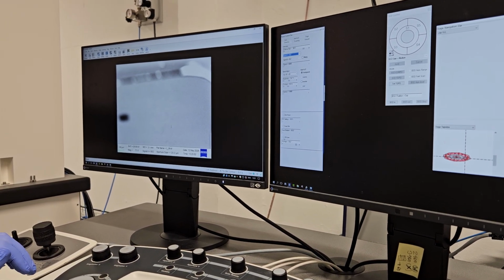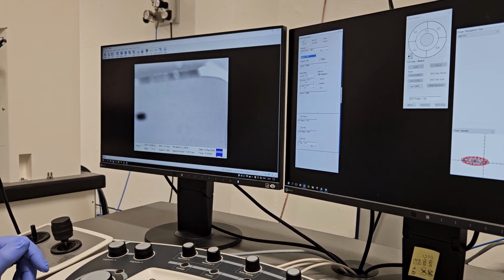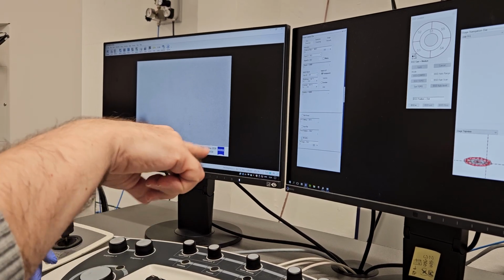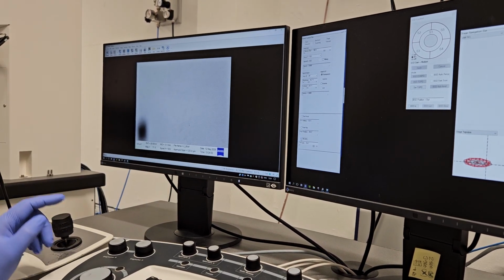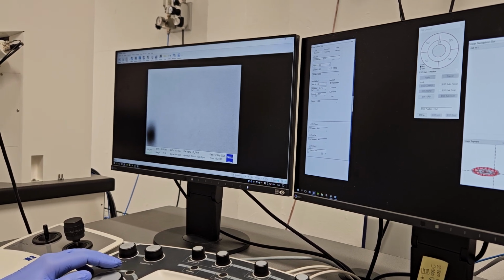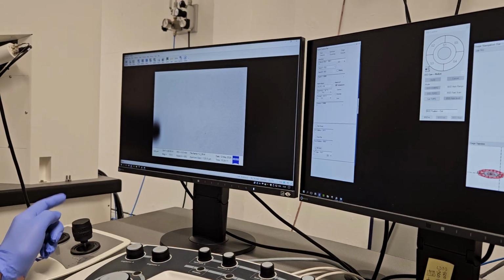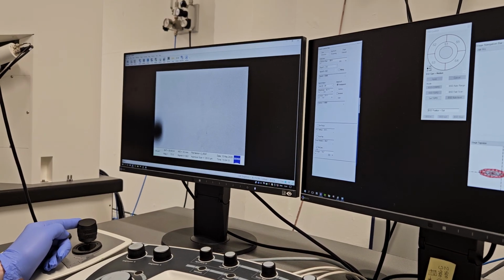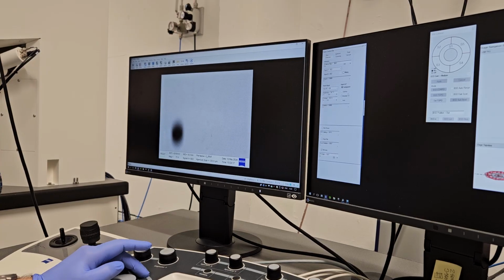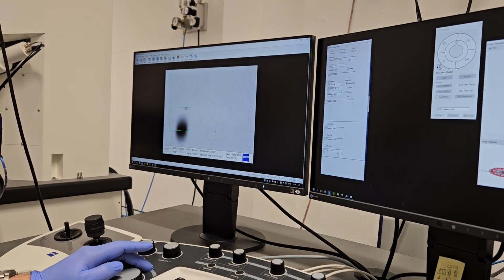Okay. So since now the sample is tilted, you need to do tilt correction. And when you remove the sample, don't forget to deactivate it, because people who come after you and who know nothing about EBSD will not be able to recognize. Yes, and that happened once. To you? Someone else forgot to turn off the tilt correction options. These people don't care about other people, they only care about themselves.